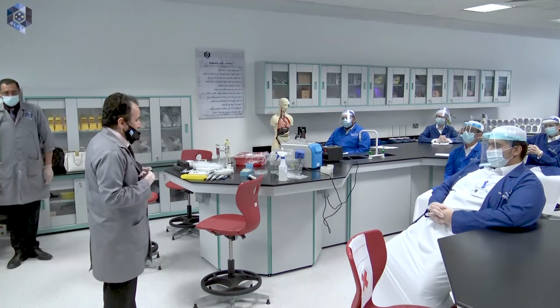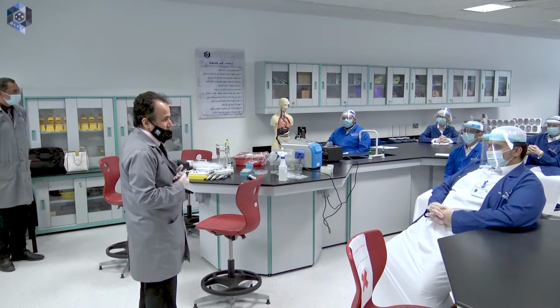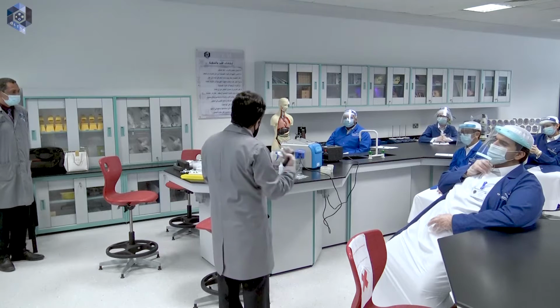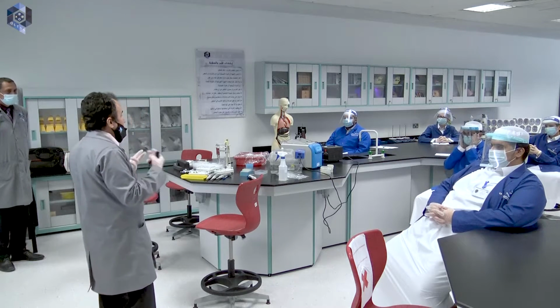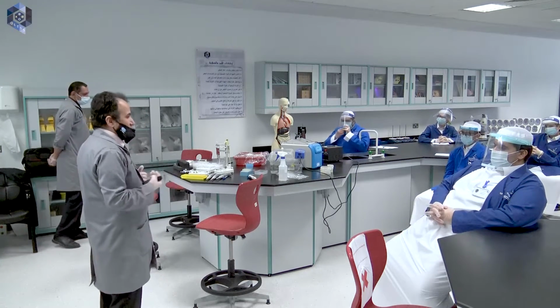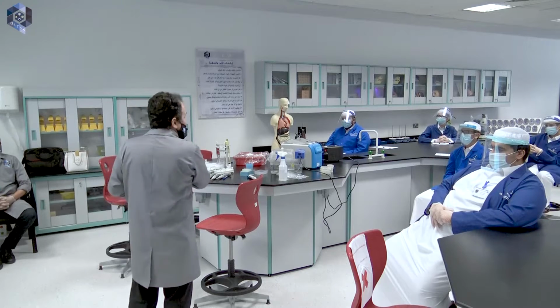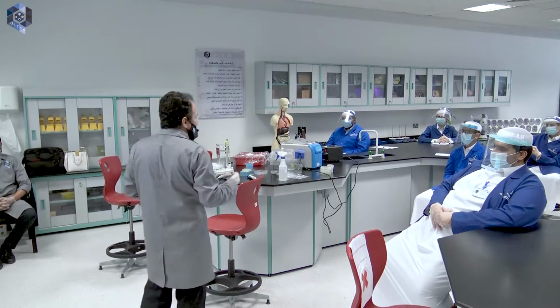The recombinant DNA plasmid. Now, what does recombinant mean? Recombinant DNA. Yes, Imadi. You take DNA from two different sources. And the DNA that we recombined in this experiment a week ago, what were the two different sources of DNA that we used? We joined what and what? Yes, Tamimi. We joined the plasmid with the gene. What kind of plasmid did we use? The pUC plasmid. And the gene, the kanamycin gene.